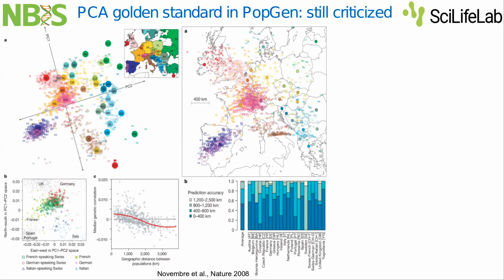People noticed a long time ago, in 2008, starting from this John Novembre paper, that if you compute a PCA on genetic variants from individuals across Europe, you can basically reproduce the map of Europe. So there is some sort of correlation between genetic distances and geographical distances. At least that was the hypothesis to test. And it looks like, at least from this paper, there was some correlation.